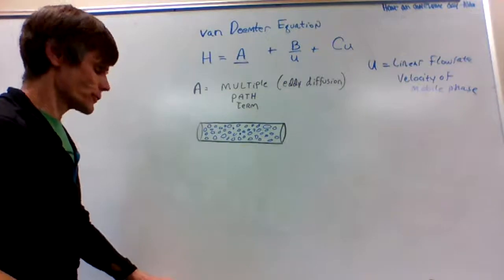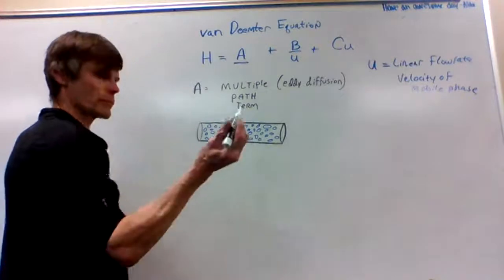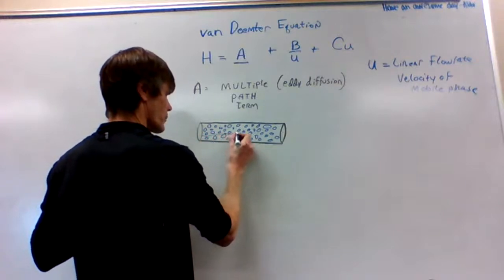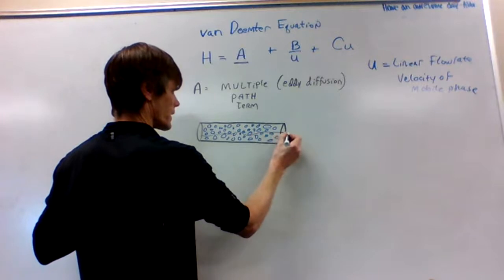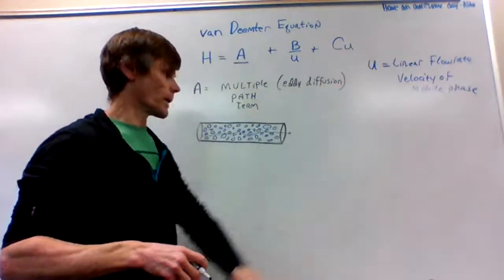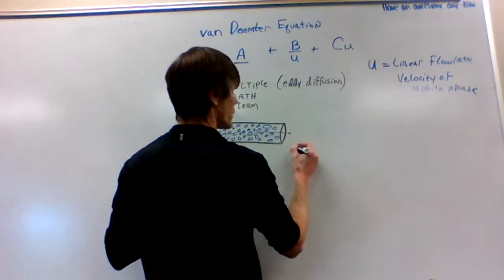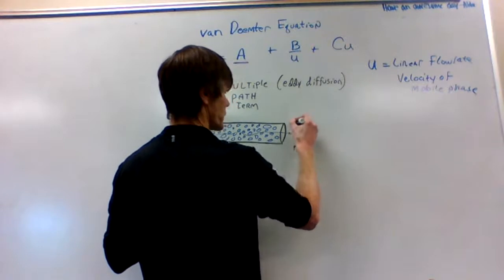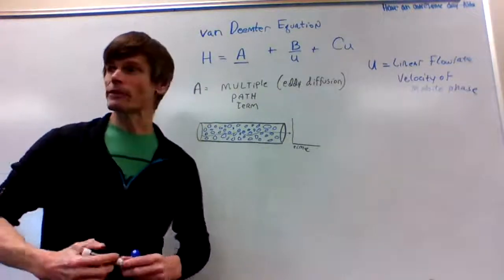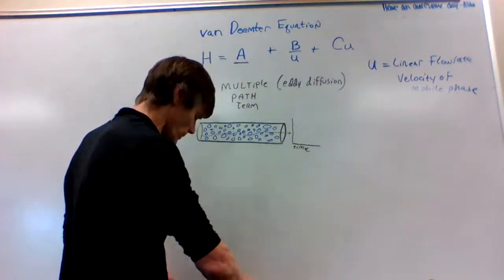Okay, we're going to put our solute in there. We're going to look at individual solute particles moving through that column. This guy moves through, and it finds a really nice path that comes out, and the distance, which would be related to its time based upon our flow rate, will come out in the smallest distance or the smallest time unit if we're looking at a chromatogram. So this one will come out here. Yet another particle is in our sample that we put on at the very beginning. Again, this is just a sample plug we're putting on the beginning of that column.